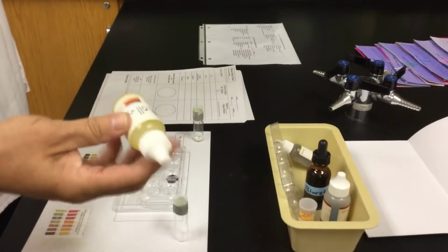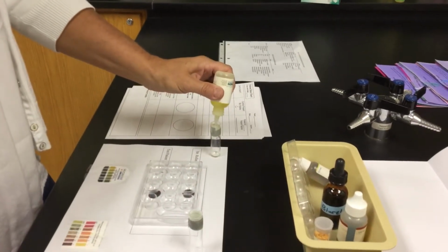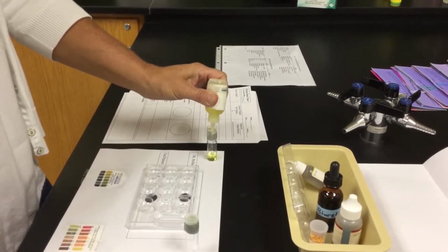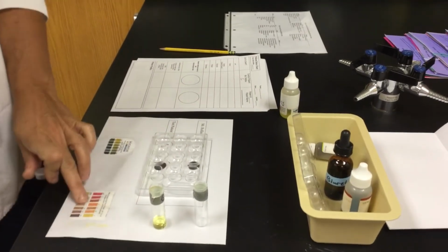Mr. Rollins' urine is labeled, so we're just going to give it a little shake, and it's going to tell you to add about 10 drops or so into the glass tube. Now we're going to do a couple things with this glass tube. The first thing we want to do is test pH, and this is something that you should have done in first year bio. And with pH, I put a little scale down here.